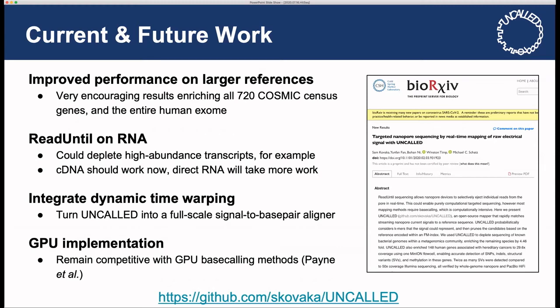There is a different sort of k-mer model about how nucleotides passing through the pore give you different signal characteristics. That's what we're trying to learn right now. That requires some optimization, and there are other further optimizations that we plan to do in the near future.